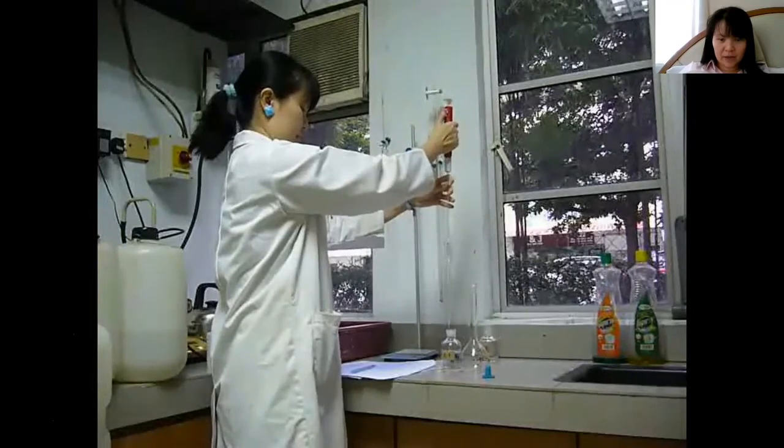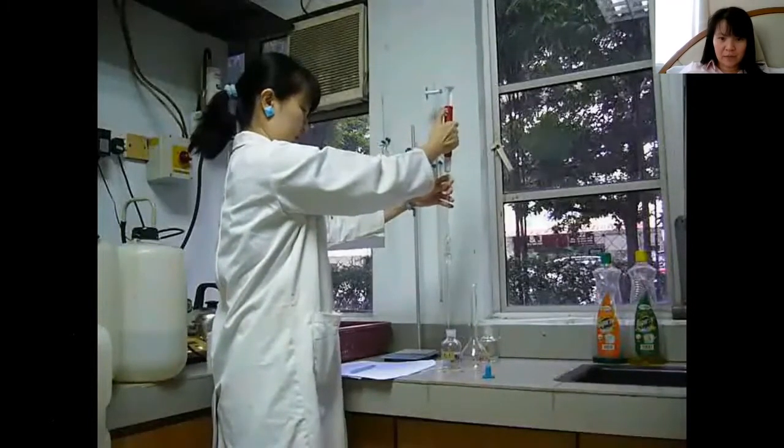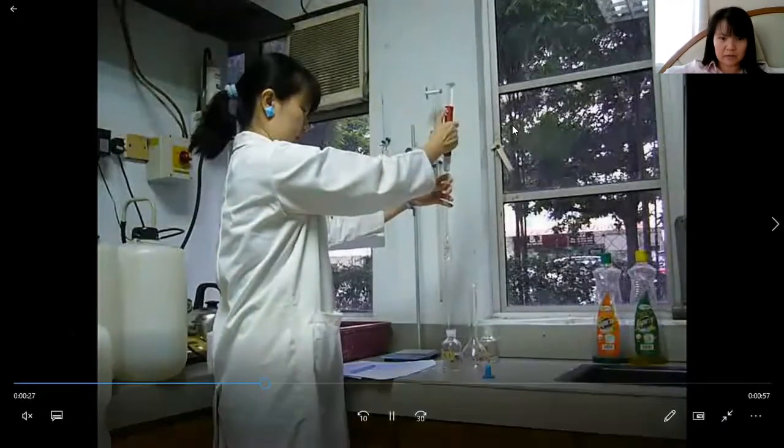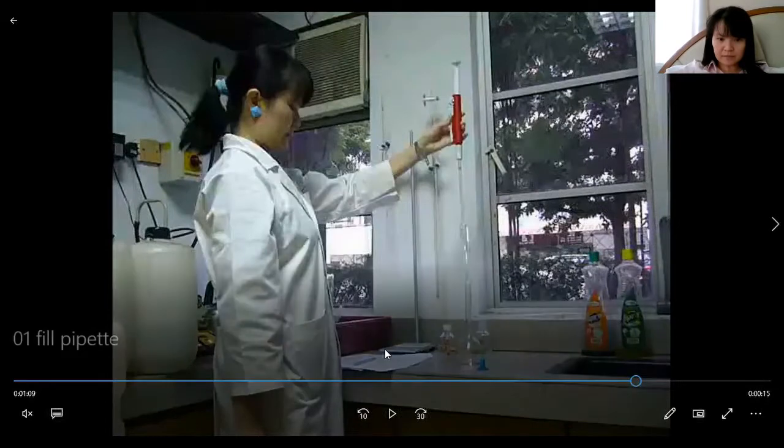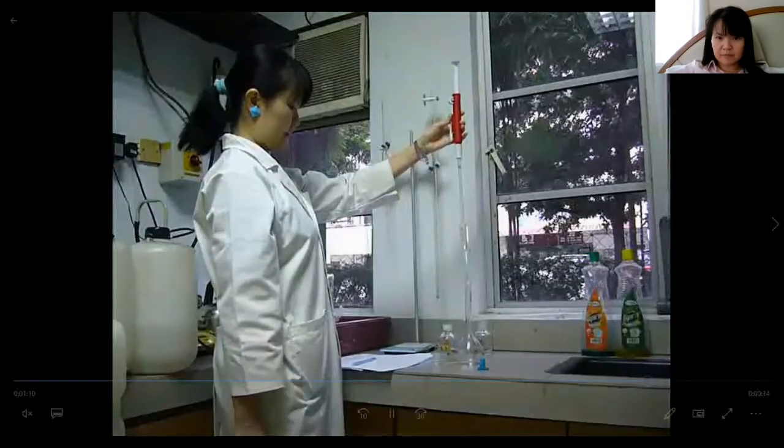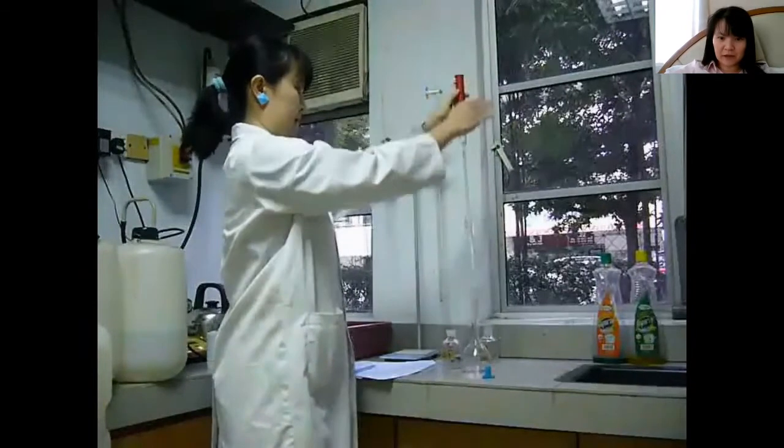Now we fill in the pipette with the pipette filler until it reaches the fine mark on the pipette. Then we put that volume into the volumetric flask.